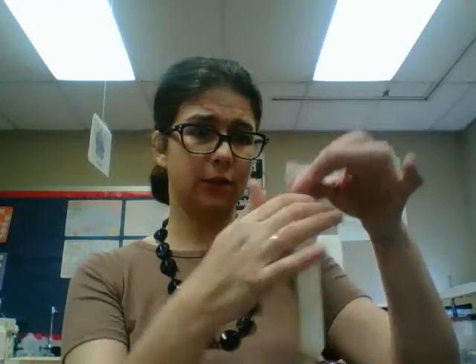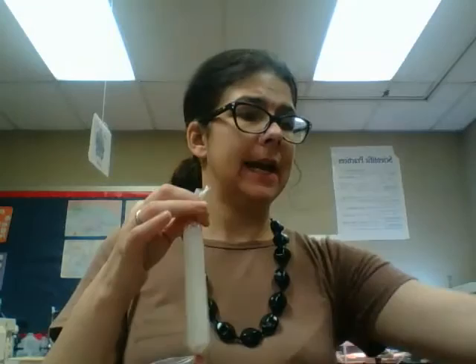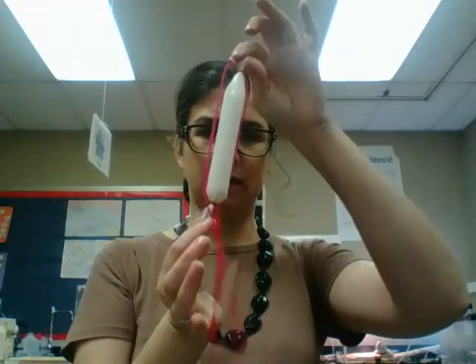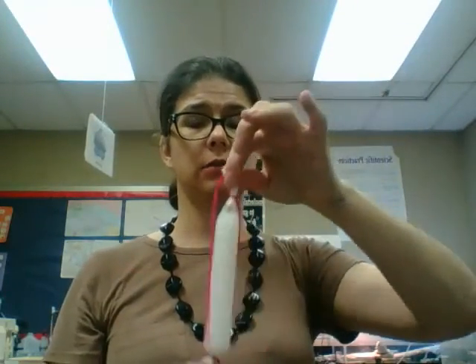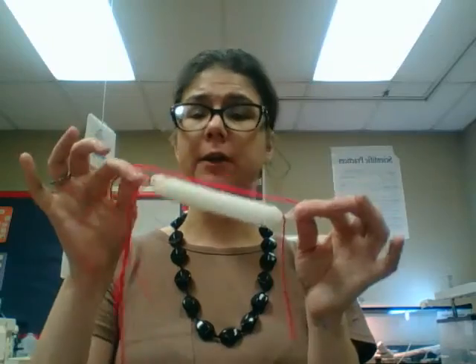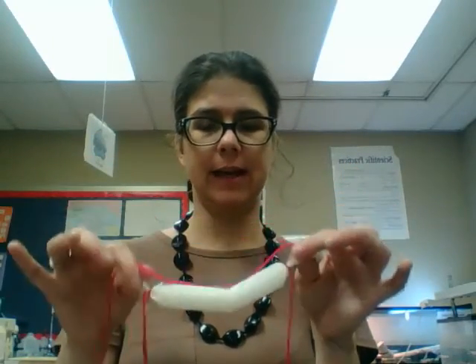Once it's about two-thirds of the way full, take another piece of string and tie the top of your little sausage — like a traditional butcher's sausage casing tied at both ends. When you are done and it won't come out of either end, you're ready to place it into the solution that the directions tell you to. Then you can proceed and watch the observations from there. I hope this helps you in setting up your dialysis tubing. Let me know if you still have questions.